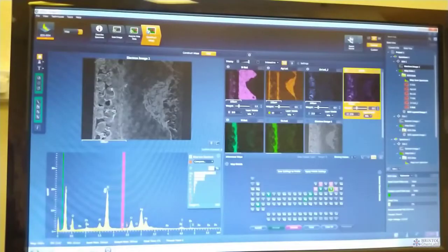As well as signals for imaging, when the electron beam hits samples of material, x-rays are also produced. The x-rays are characteristic of the elements in the material. They provide a signature for the chemical composition. This is the spectrum. Here we can identify all the elements and their relative composition. In this case, we can see a strong signal for silicon.